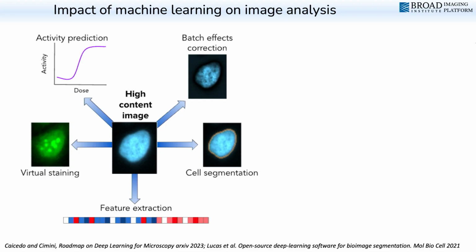It's just one of them, my lab's focus, but it is one in which we have seen some of the most dramatic improvements if you've been following the computer vision field over the last decade and a half. There's been a revolution, right? And a lot of the deep learning revolution really started there, one could argue. And so those advancements in computer vision have made their way over time into bioimaging, into the methods for analyzing biological images.